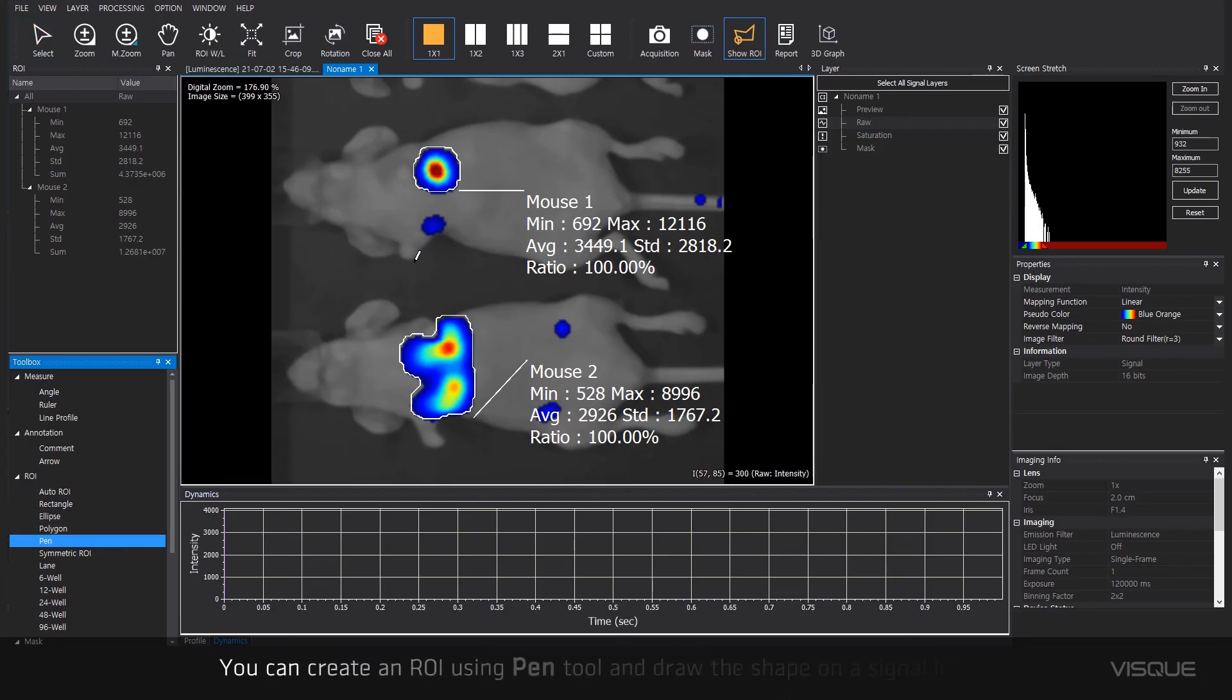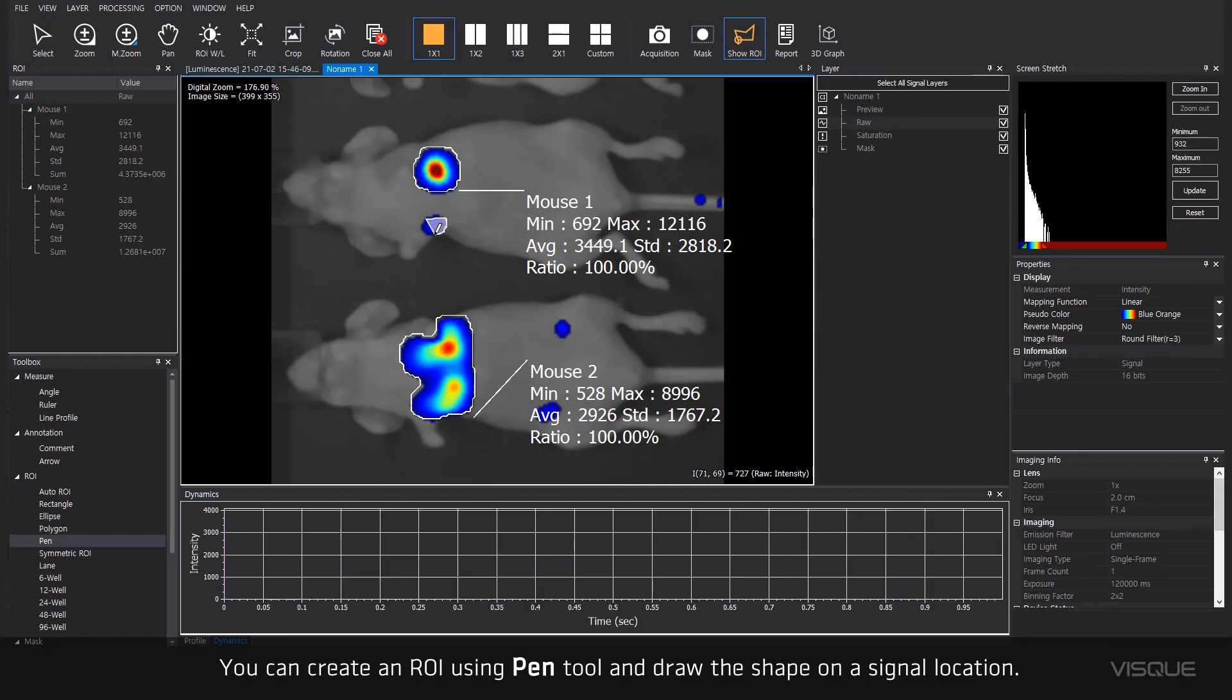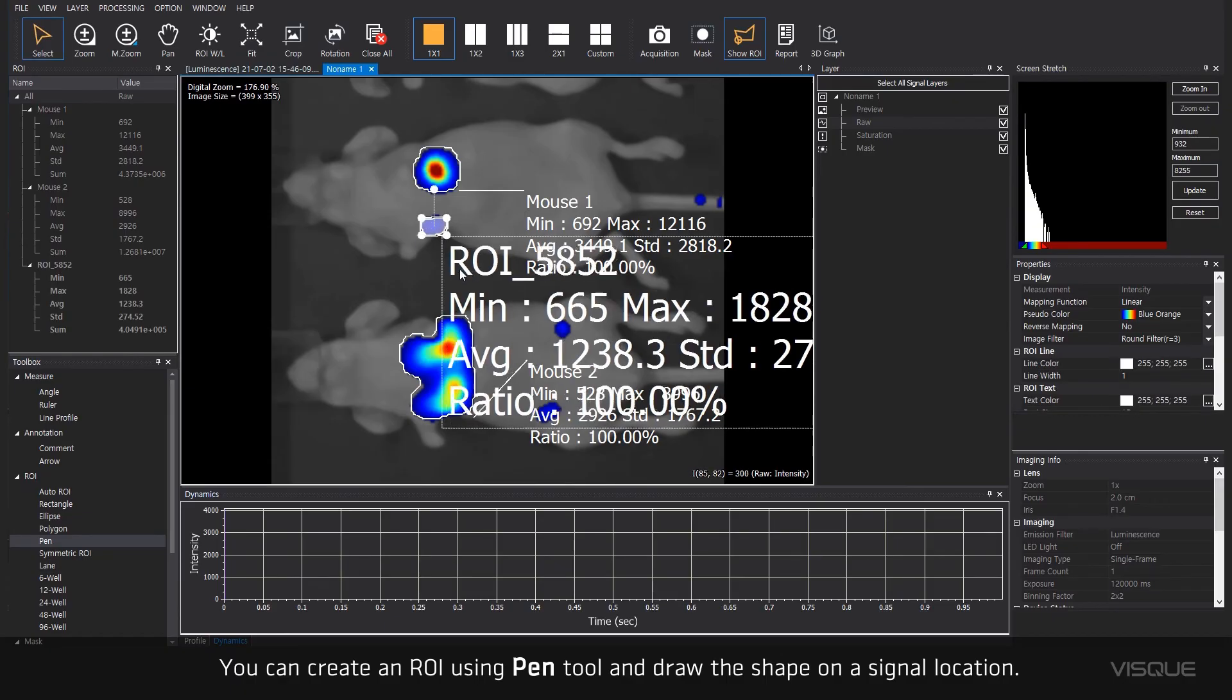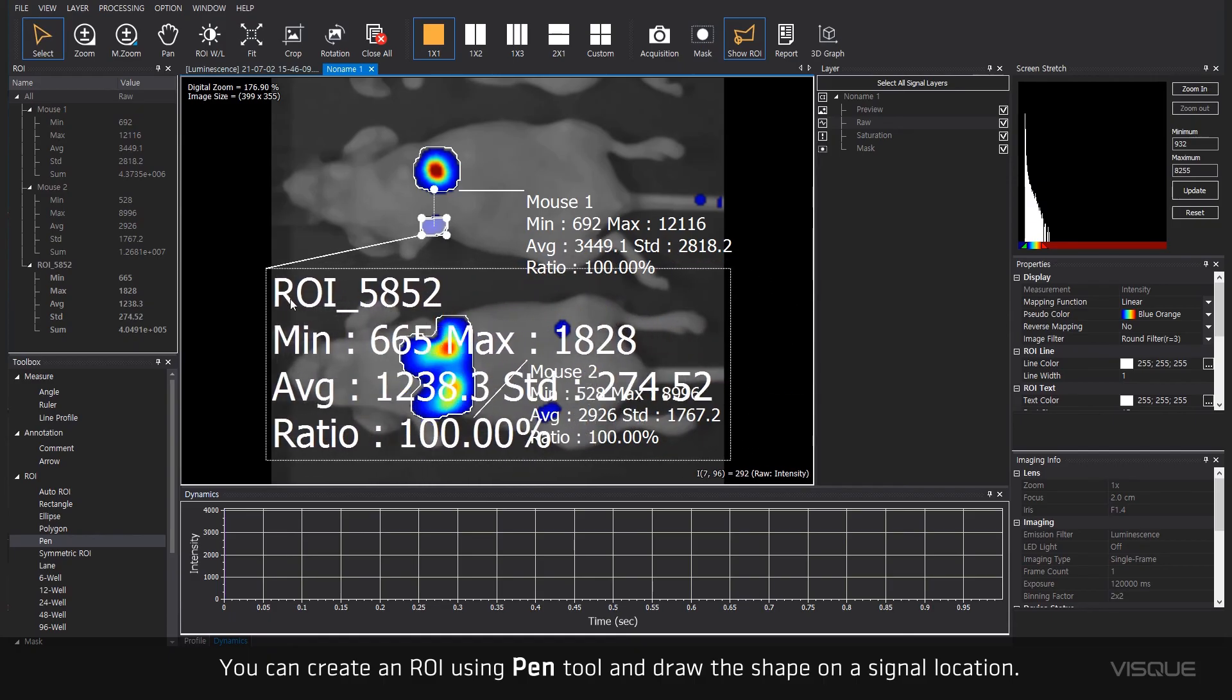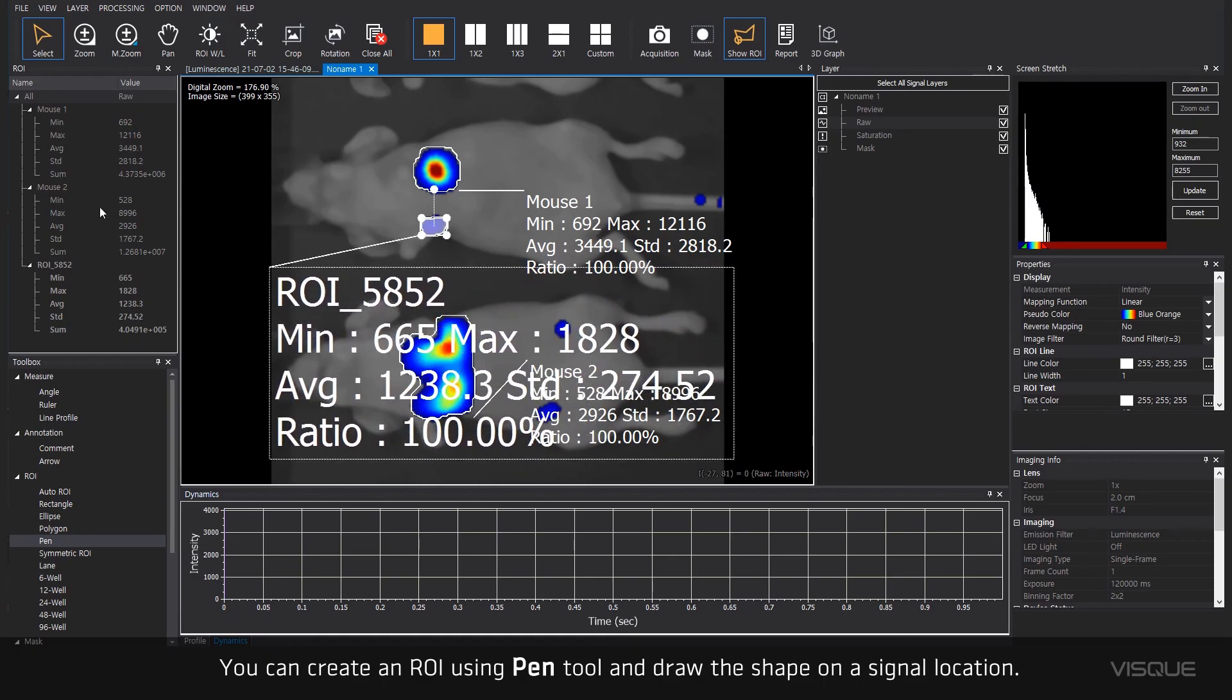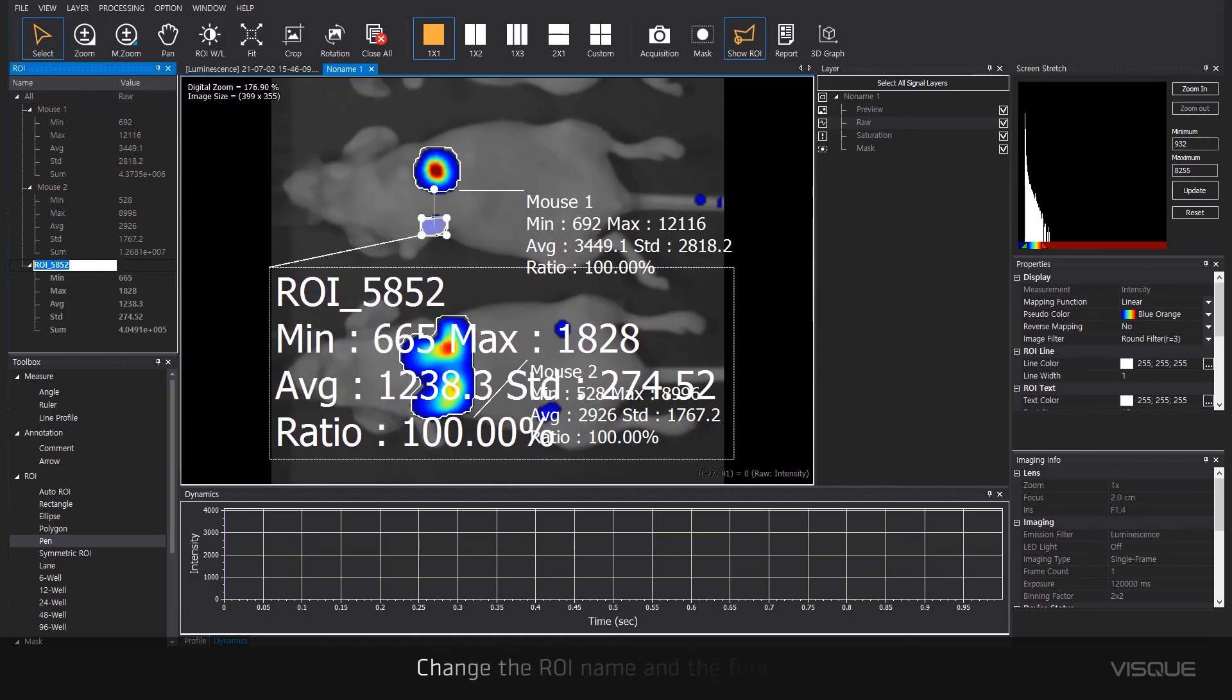You can create an ROI using the Pen tool and draw the shape on the signal location. Change the ROI name and the font size.